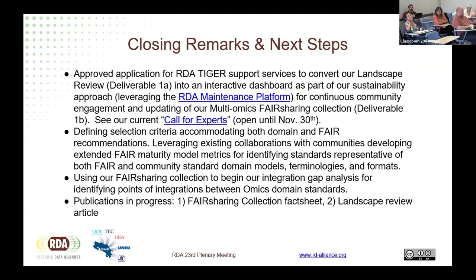So you have for every repository an assay in the ISA JSON where we will store the metadata, and there we can easily store more metadata than is required, more protocols and these kinds of things, and especially the things you mentioned. These things will be preserved in our ISA JSON and inside the metadata platform that will produce this ISA JSON, but it might indeed not be visible in the end repository, depending on what they index there. I don't know if this answers your question.